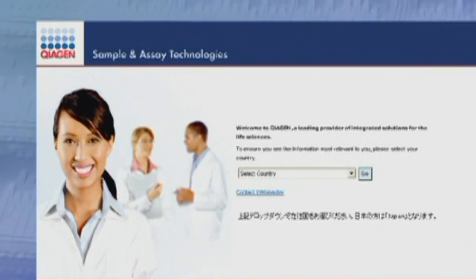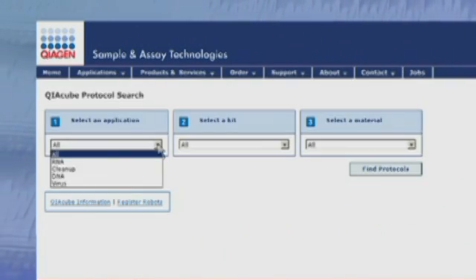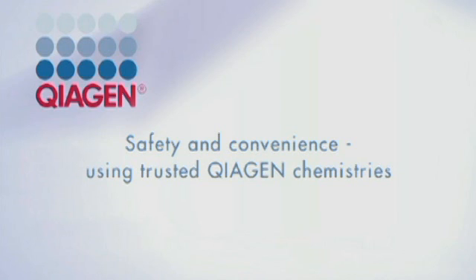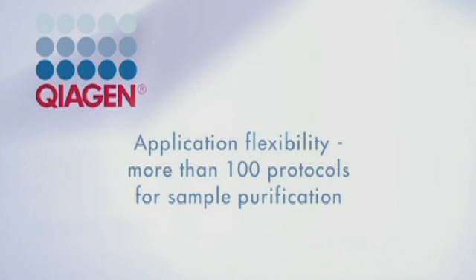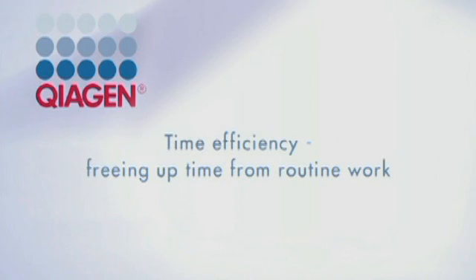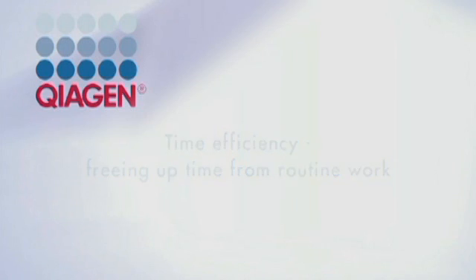Find out about the continuously growing number of applications. Visit the new Kaya Cube web portal and simply download the protocols of your choice. The transition from manual to automated processing has never been easier. Enter the new era in sample prep and leave spin column processing to the Kaya Cube.